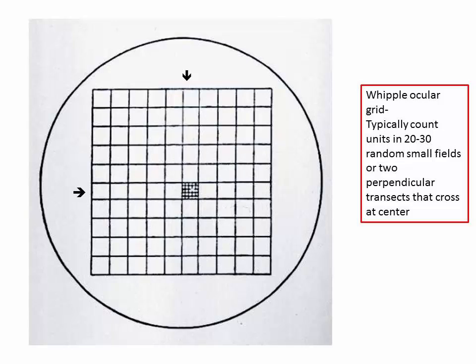This is what I have used, and I don't get any objections to it, and I think it works well. It's a little more expensive than one of these other chambers, but it's out of the medical use. It's literally a hemocytometer for counting blood cells.